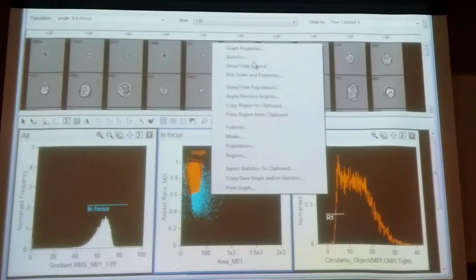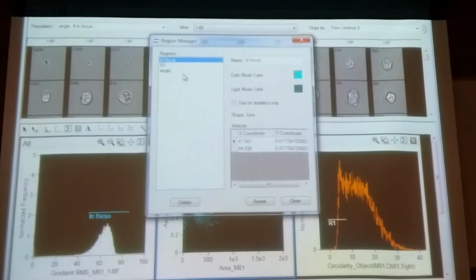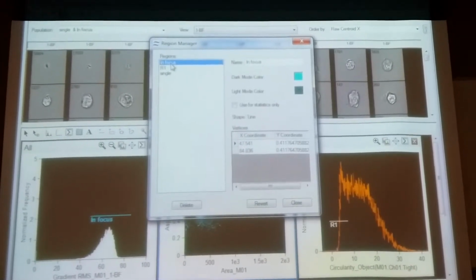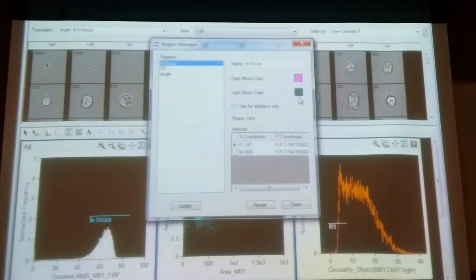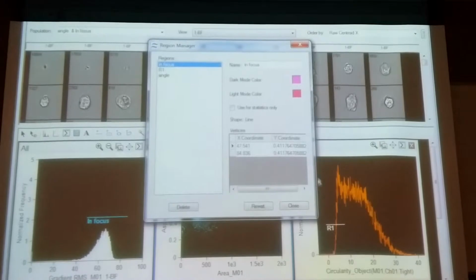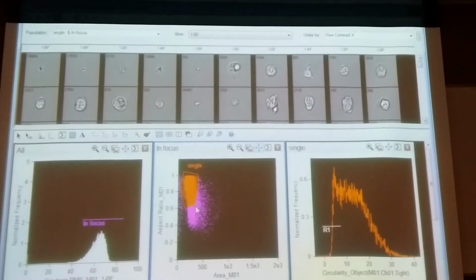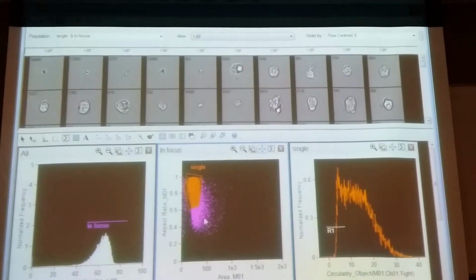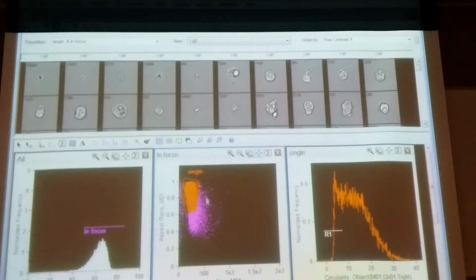Well, it's just really small. Is there a way you can change the size of the crosshair? You can't, but you can change the color behind it. So if I change the in focus color from blue to pink, right there you can now see it better. I think that does throw people. If maybe the crosshair was a circle that blinked. Nope, you can't change it. They need to change that.